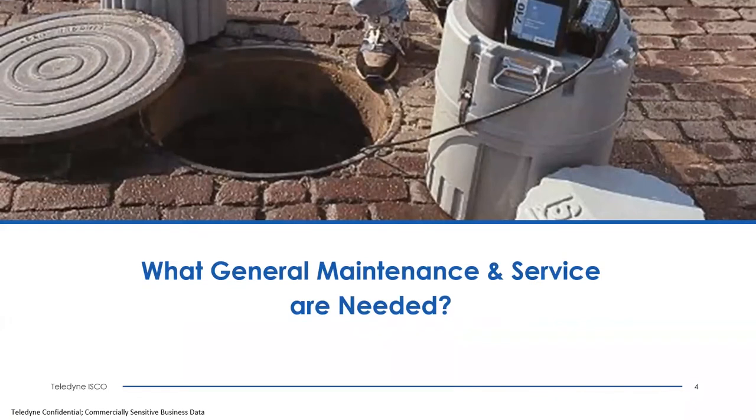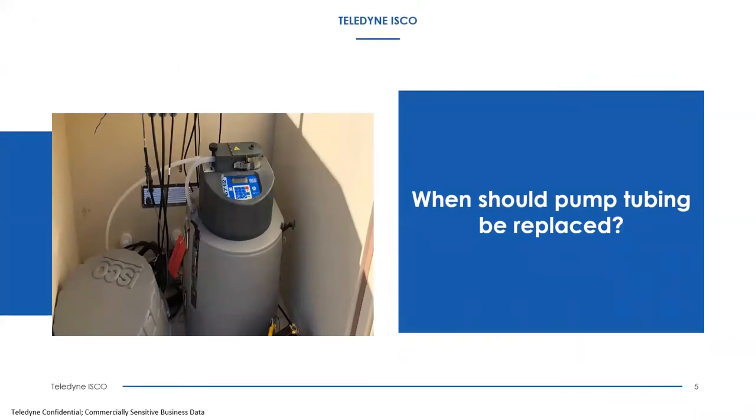Our first topic is the general maintenance and service required for working on our portable samplers. The first question: when should pump tubing be replaced? The samplers, the 6712 and others, have an actual pump revolution counter that determines how many rotations the pump has gone through since you replaced the last pump tube. Most samplers have a 1 million pump count, and a warning will appear on the front screen to please replace the pump tube. You can then replace it and reset the counter within the software.